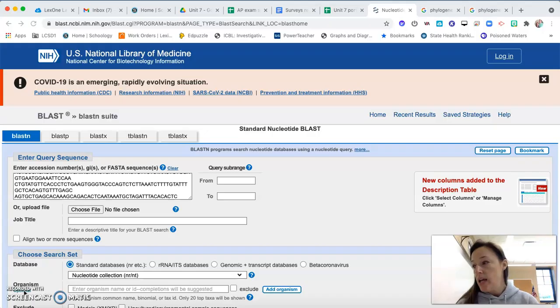So basically, I can use the cladograms and the information I get from the BLAST site to apply that to a new situation with your protein that you were given, and then use what I learned from that protein, whether it was ubiquitin or polymerase or whatever it was. Then you can use that information to deduce how closely related organisms are. And so you were able to look at the query covers and create a new cladogram. So that's what that last one is talking about, is basically you taking the information you learned from the beginning of the BLAST lab and applying it to your protein.